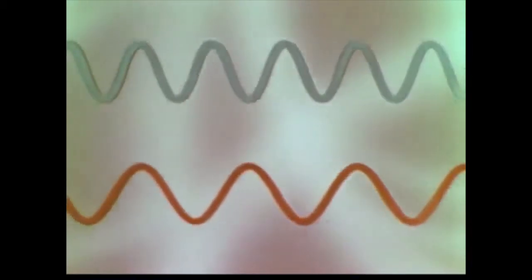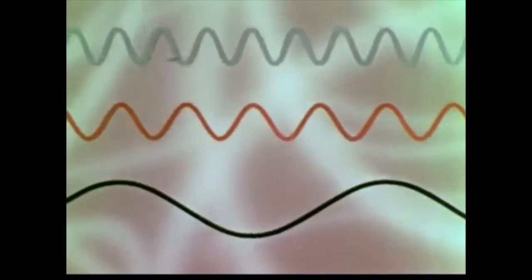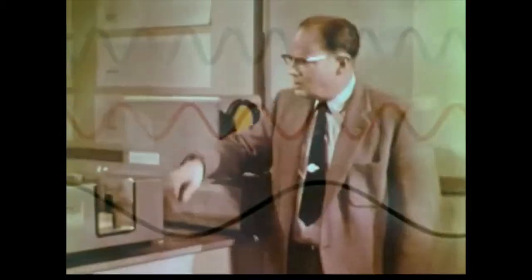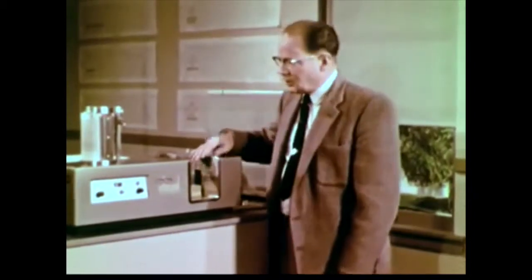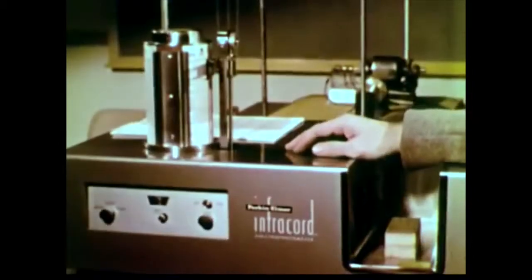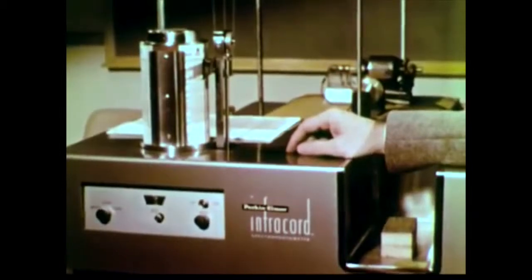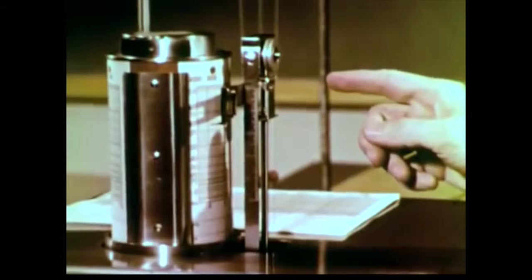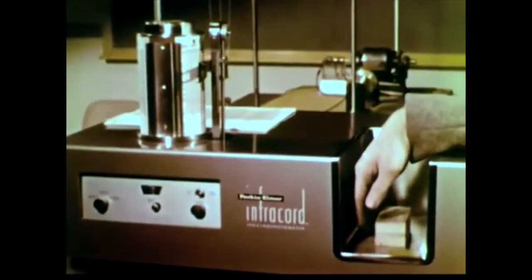We see that beyond the red light waves, there are infrared waves with a still longer wavelength and a still lower frequency. Here, we have a spectrometer which scans the infrared spectrum and draws a graph of the transmission of the sample in the infrared. In this spectrometer, the instrument runs through frequencies in the infrared range, around 10^13 cycles per second. The top of the chart corresponds to 100% transmission, the bottom to 0 transmission.